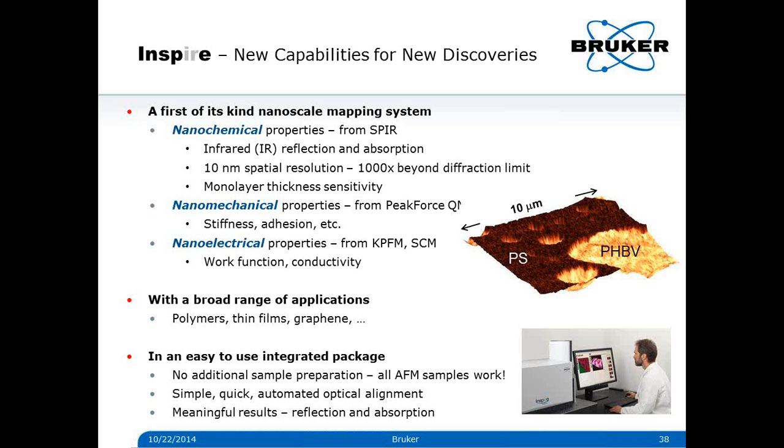Yes, it's a narrowband continuous wave laser, and the spectral width would be far below a wave number. So I think it's 0.01 wave numbers. So you get very high resolution with this technique.